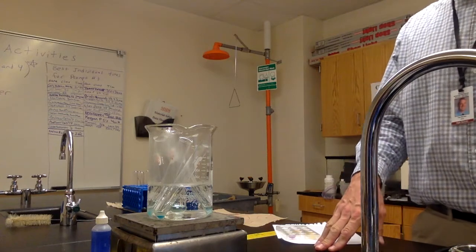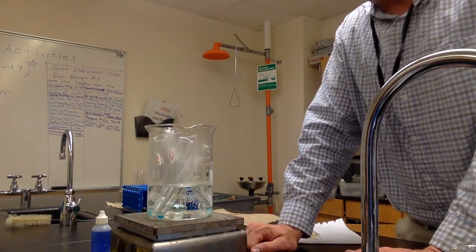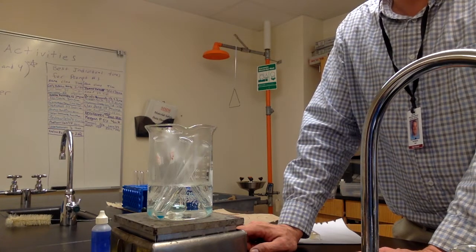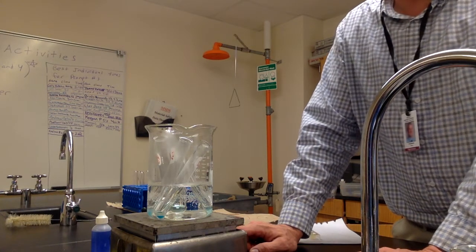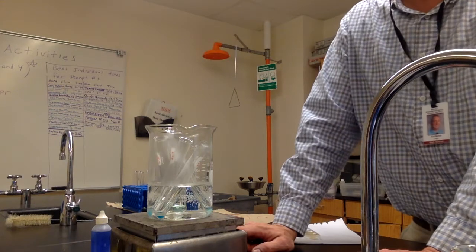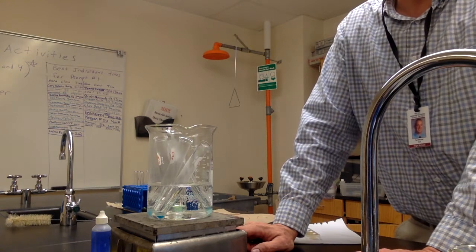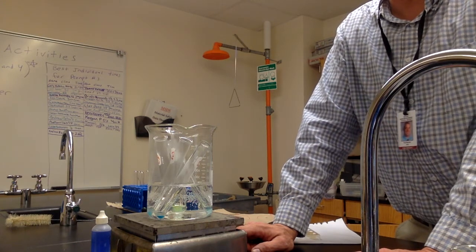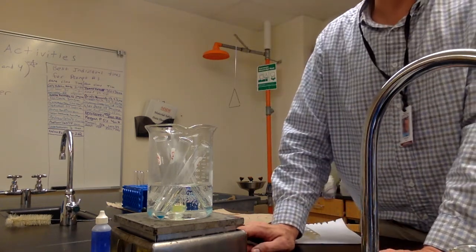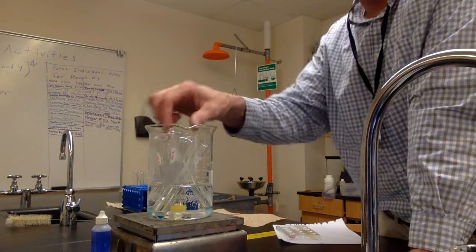A positive test for sugars using Benedict's is when the unknown turns either red, orange, yellow, green, or brick red. Brick red's like a reddish brown. If you've ever seen a brick before, you would know what brick red looks like. As long as it wasn't painted, like some bricks are painted. So red, green, orange, yellow, or brick red. As soon as you see a change in color, then it's a positive.